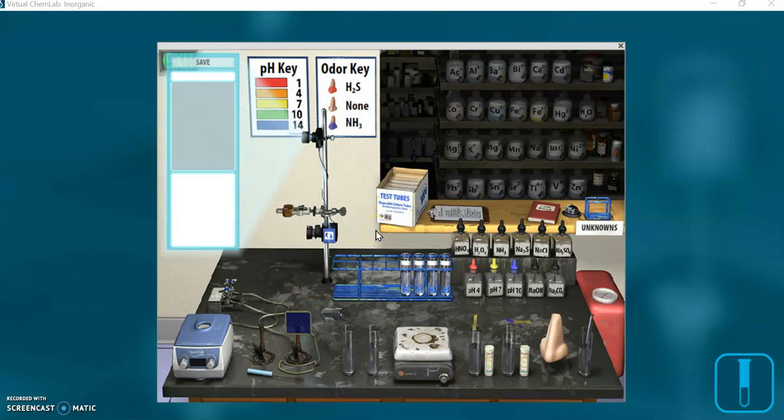In part 1, we did the 4 test tubes. We made them and then we tested them under the flame and the flame with the cobalt glass in front of it. We did the sodium, the potassium, the mixture of sodium and potassium, and the water. And we recorded the colors of the flames of those chemicals. And now we are on step 9, the unknowns.